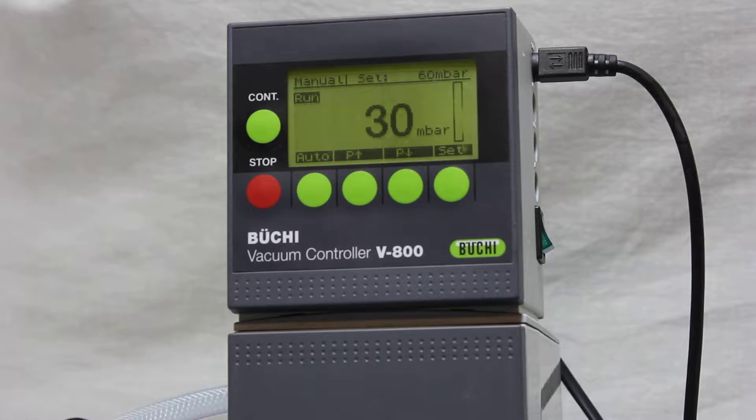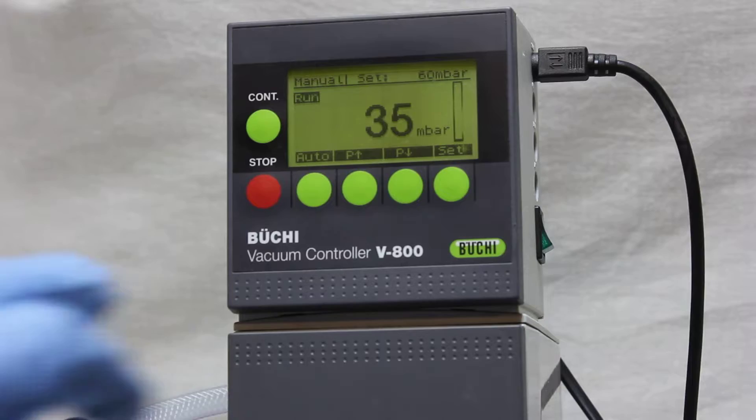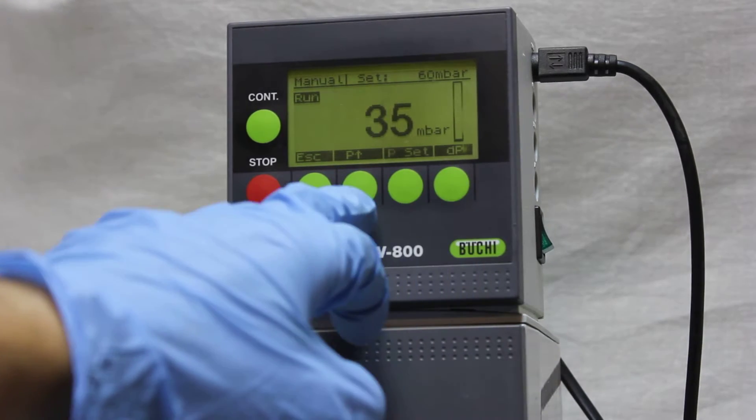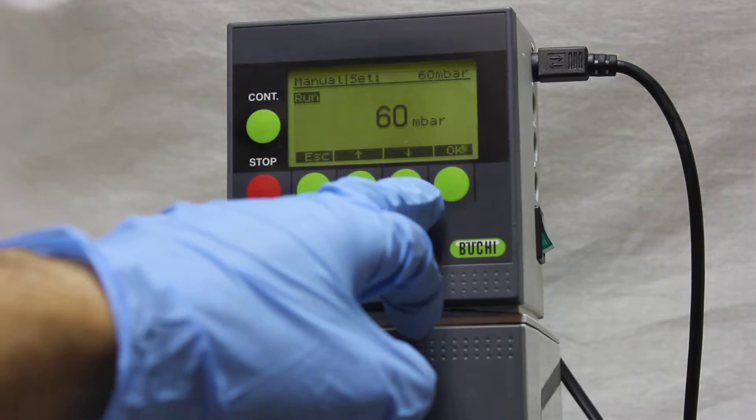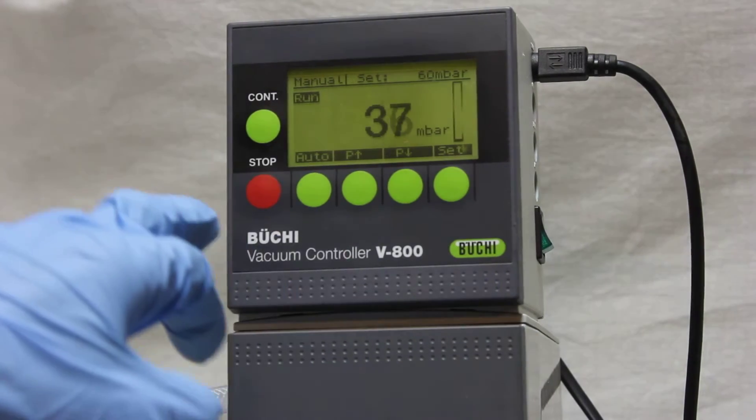Hello everyone, it's NanoPlatting again. In this video I just wanted to show you how the vacuum gauge controller controls the vacuum in this system. I've already set the vacuum gauge to 60 millibar.